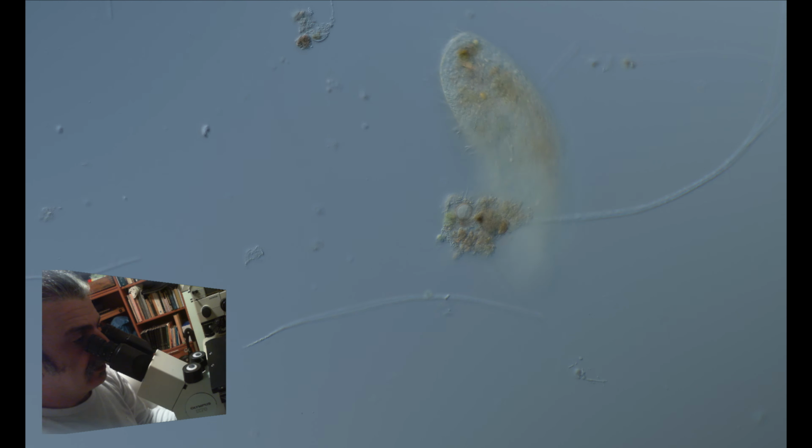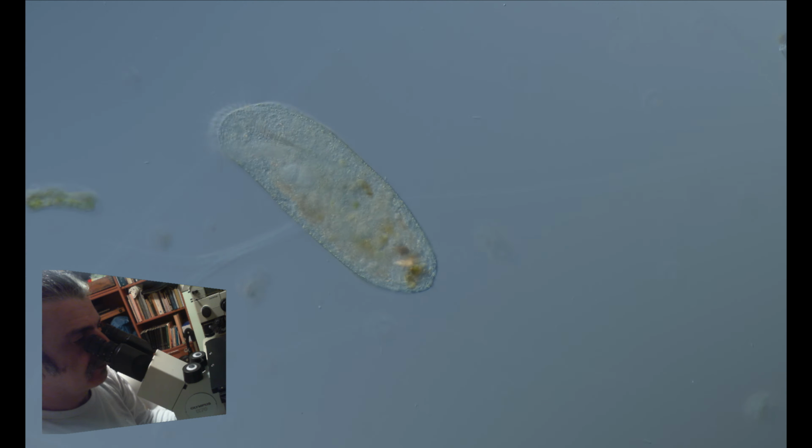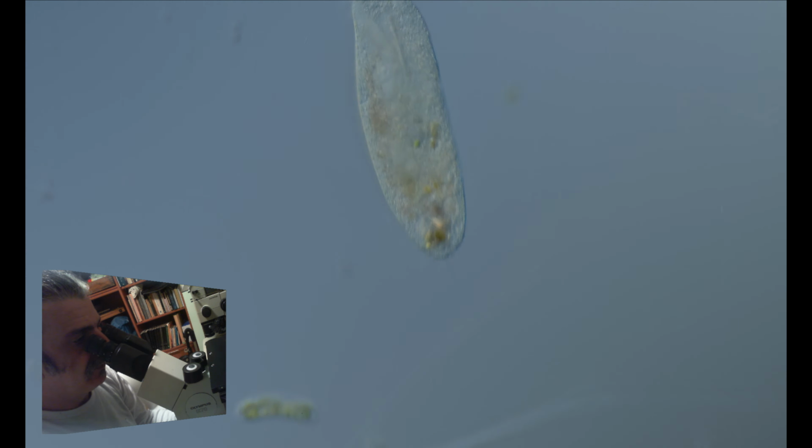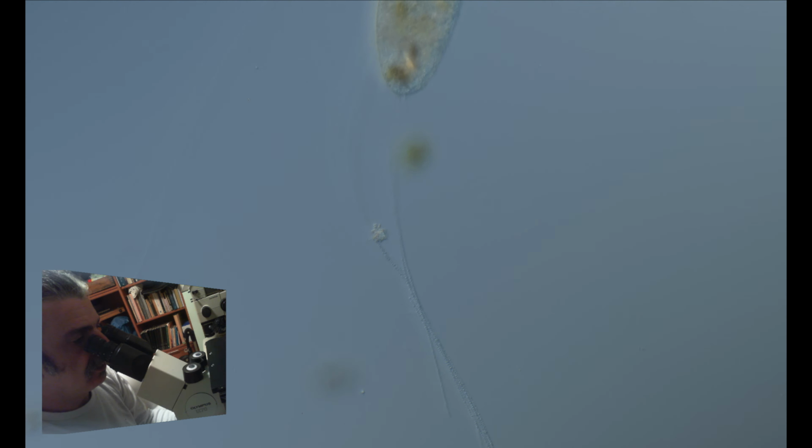Yeah, that looks fine. And you can see its cilia are somewhat thicker than what we've seen before with other ciliates, and that's because hypotrichs have merged cilia that help them to kind of walk on surfaces.